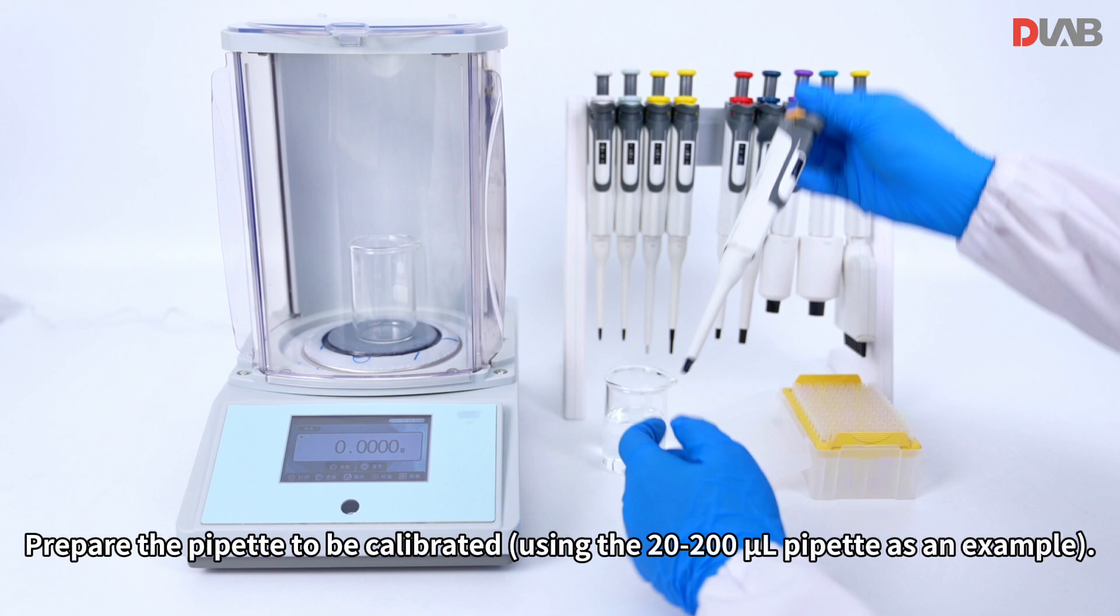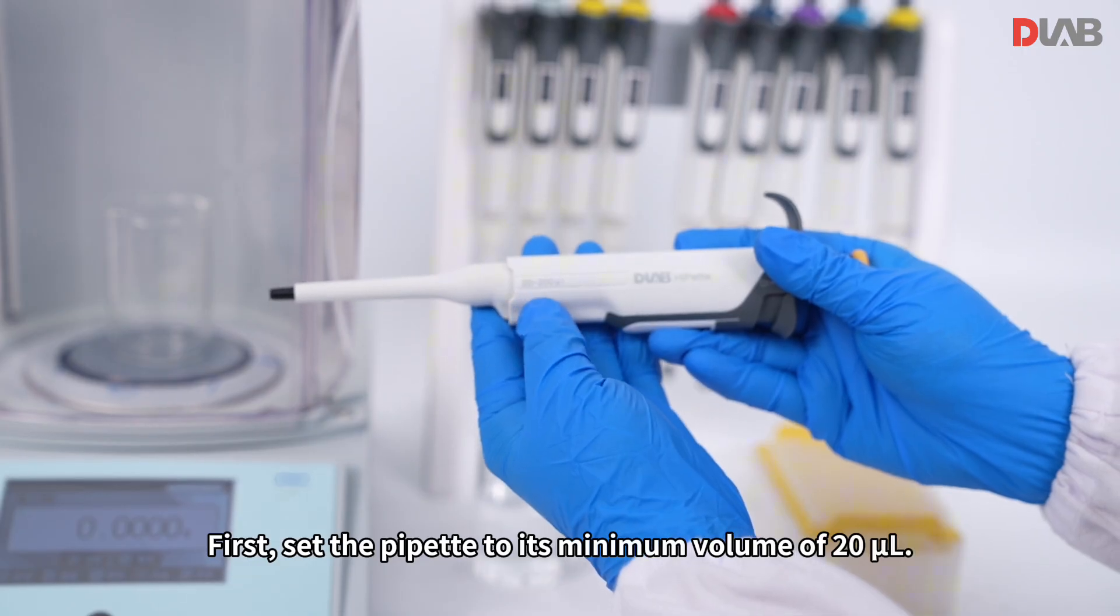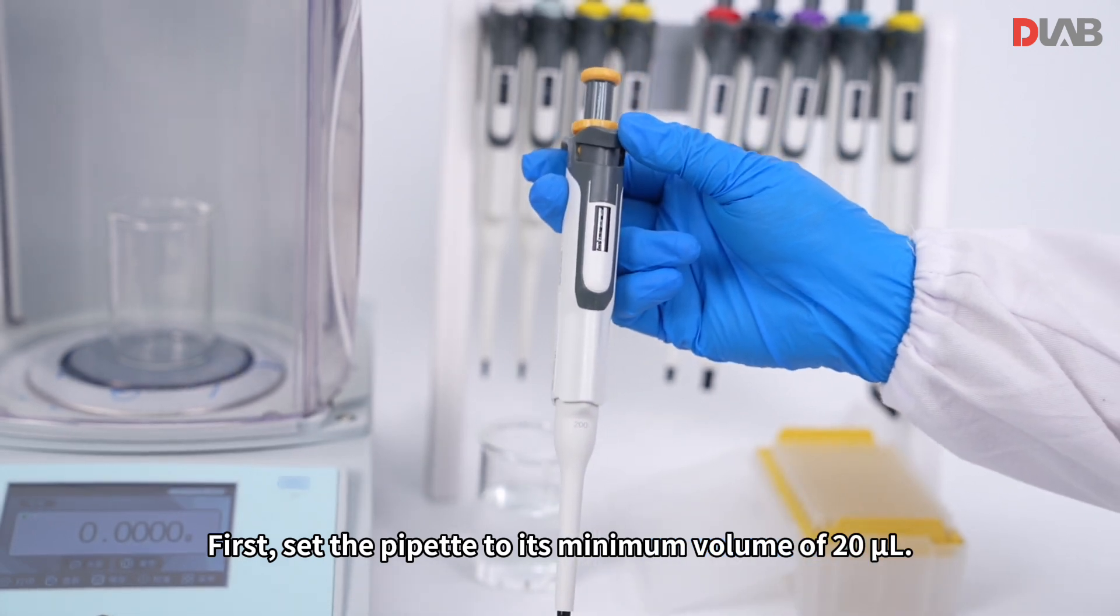Prepare the pipette to be calibrated. First, set the pipette to its minimum volume of 20 microliter.